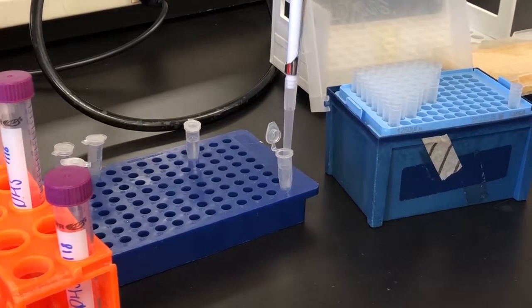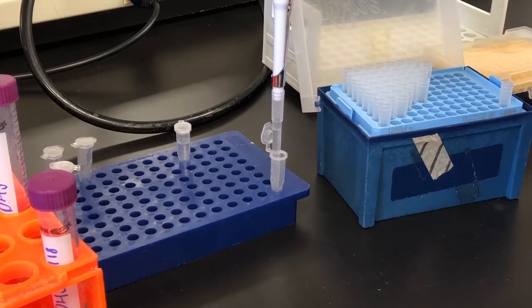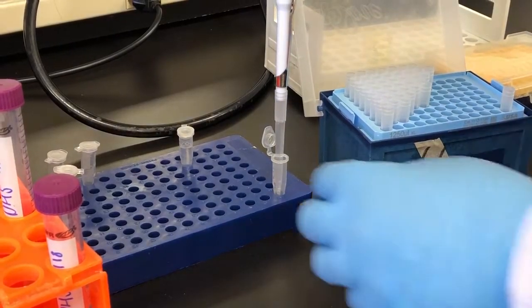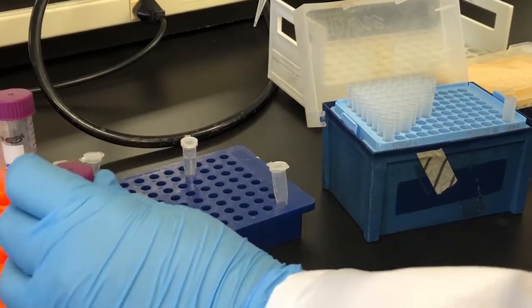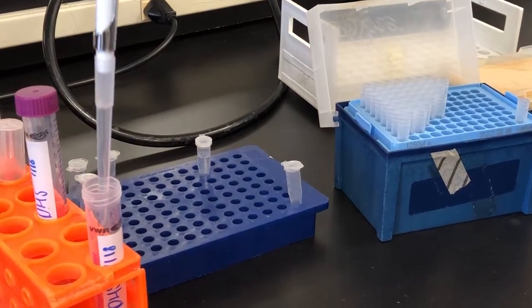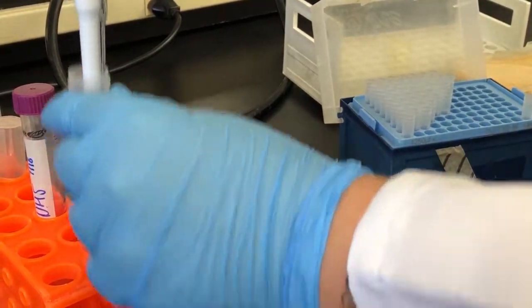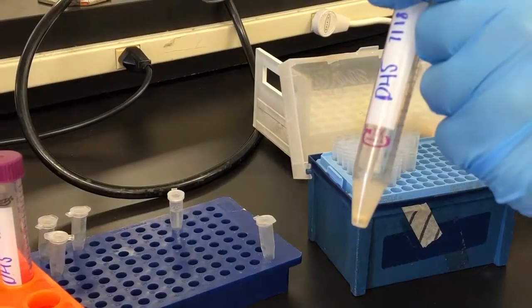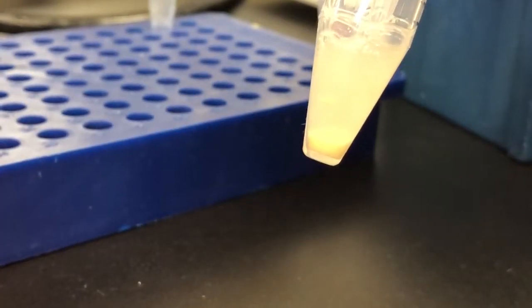Now I'm removing the bacterial cell lysis buffer that contains the ProBlock inhibitor out of the tube and putting it into another tube that contains the bacterial cells that had been spun down to the bottom of the tube. Next I gently pipetted up and down until the pellet was homogeneous with the lysis buffer.